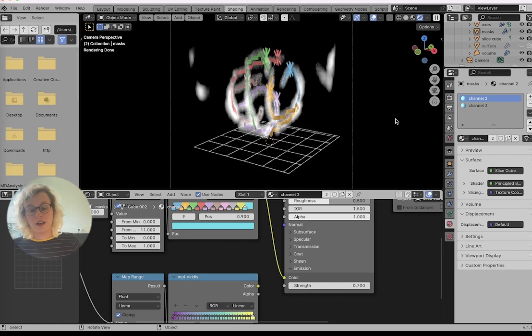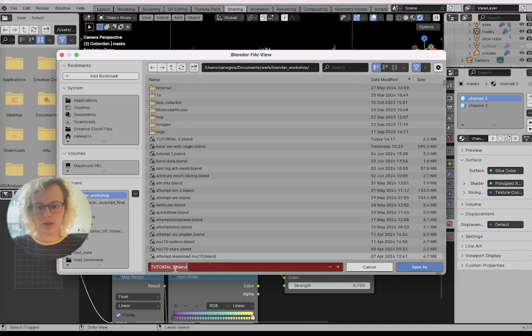So two things that are kind of missing right now in this to me still is the size of our grid in the frame and the time scale, because we actually have time in this data set. I'm going to quickly intermediately save as well.